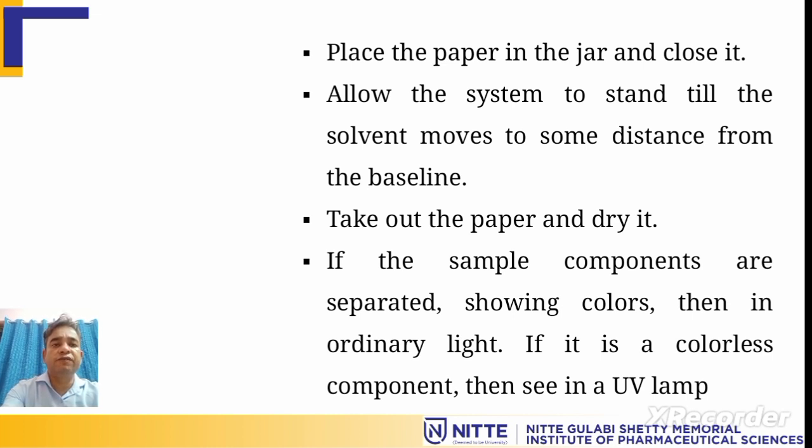You can be very watchful when you have a colored compound, you can see the separation, whereas in a colorless compound it is quite difficult. So we generally mark the distance till where it has to travel. After a sufficient run of the solvent, we take out the paper and dry it. If the sample components are separated showing color, then ordinary light is quite enough to judge that separation has happened.